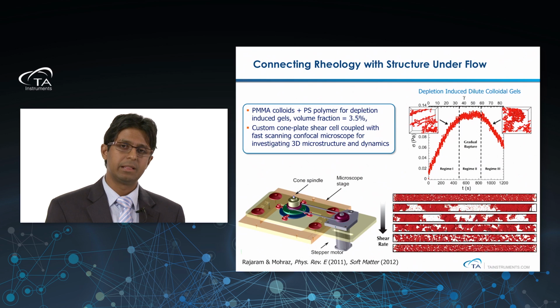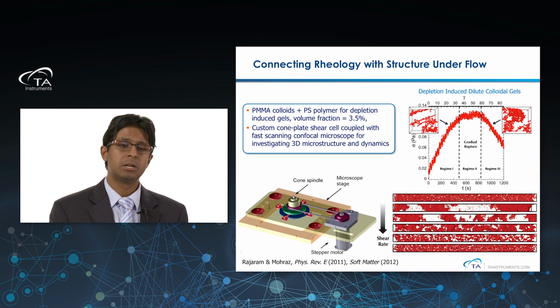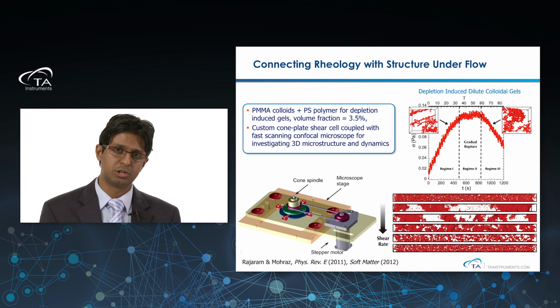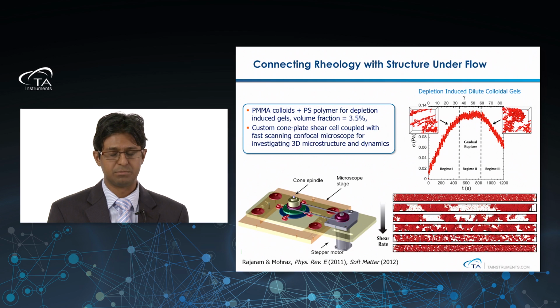We've also investigated this as a function of different shear rates. The top panel shows a mosaic structure under quiescent conditions. You can see that the structure is fairly uniform before we start applying shear to it. And as we apply shear, we bring about these shear-induced changes in the sample that are dependent on the shear rate that it's being subject to.